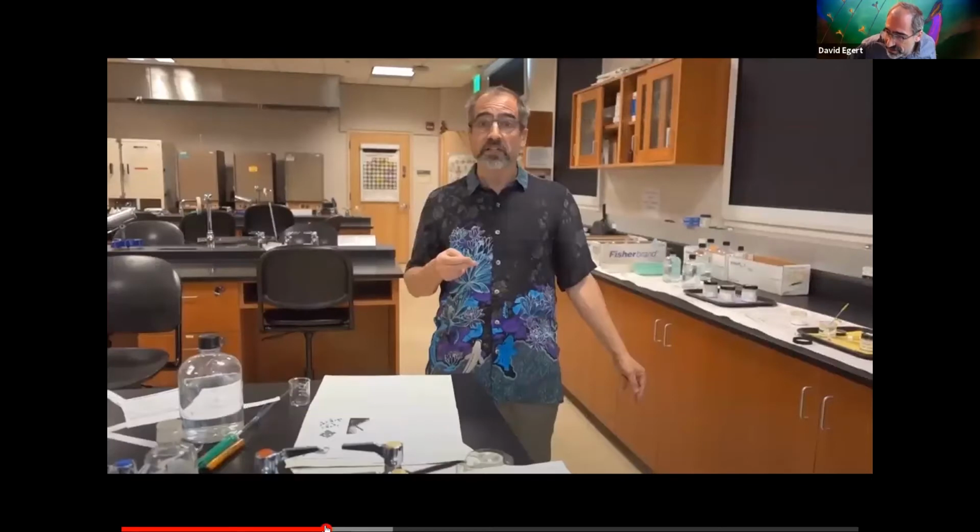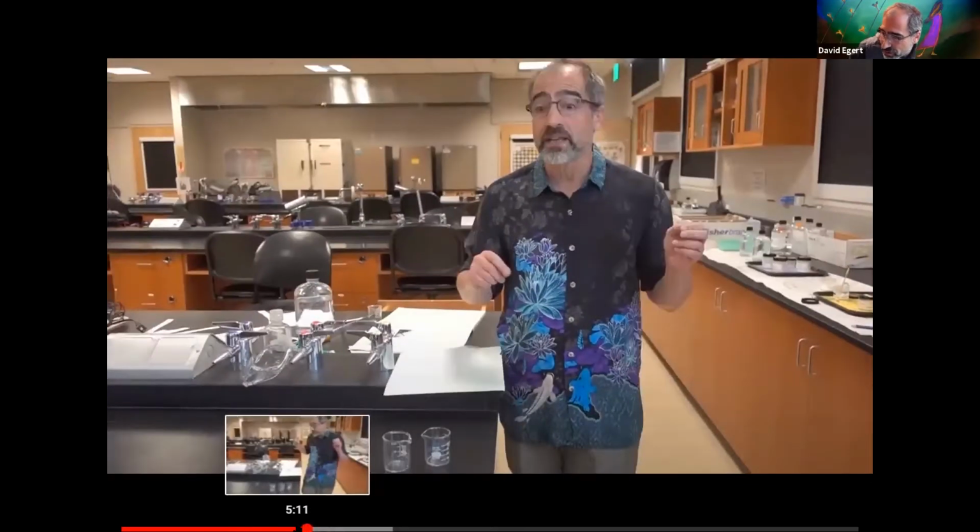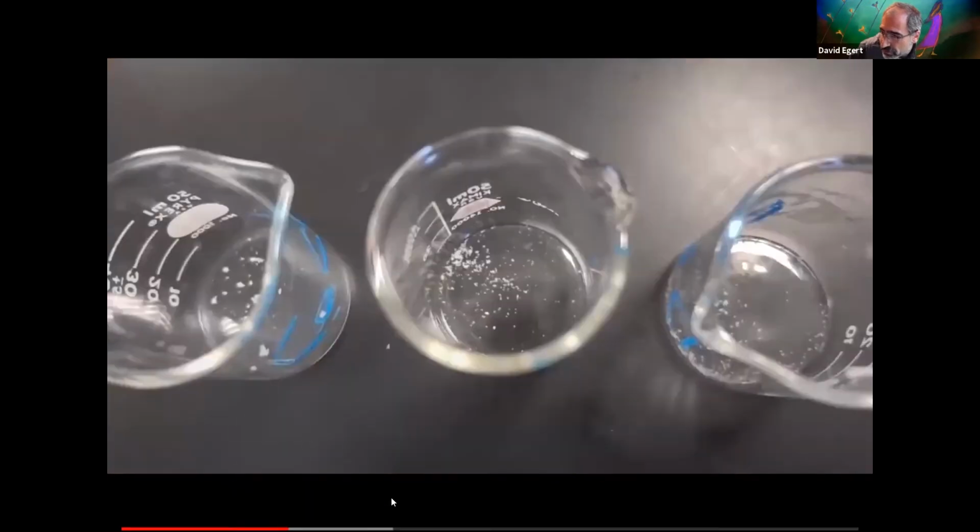Where is it? Hold on, I'm trying to get to where there was that view where you're actually looking down on them. There they are. I can say they all look pretty similar, kind of what I'm sure most of you have seen salt crystals before in your life.